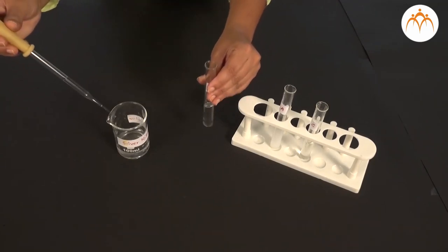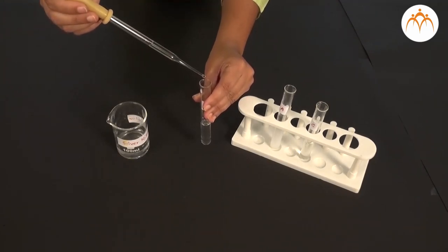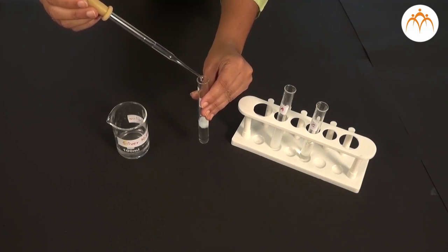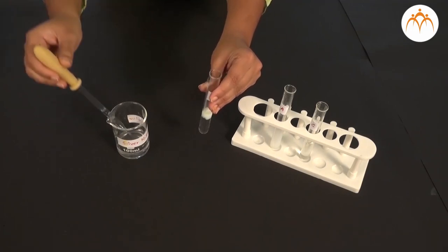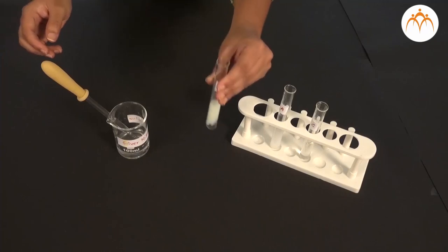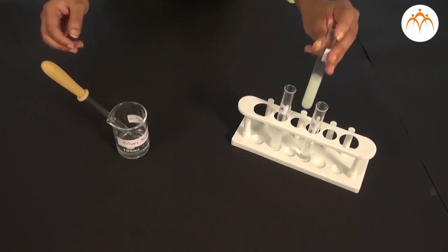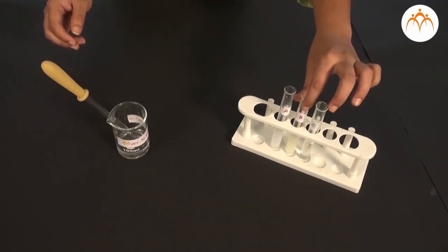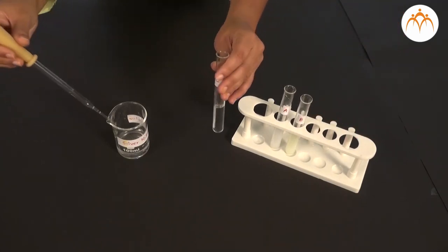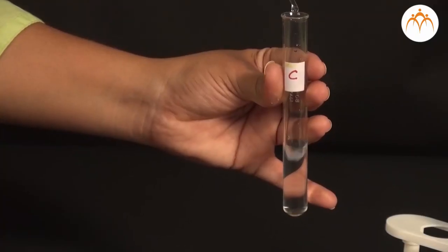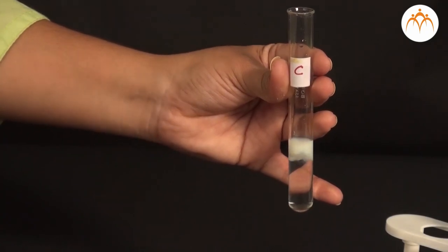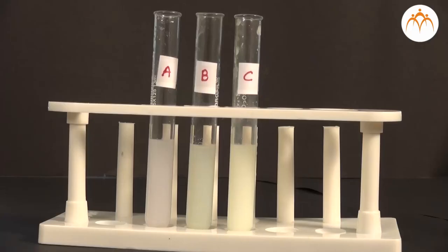In all three test tubes, you will find precipitates. It means that when silver nitrate reacts with these three compounds or solutions, precipitate is formed. This indicates that there is a possibility that there may be halides or compounds of halogen in these three solutions. These halides are giving us precipitates.